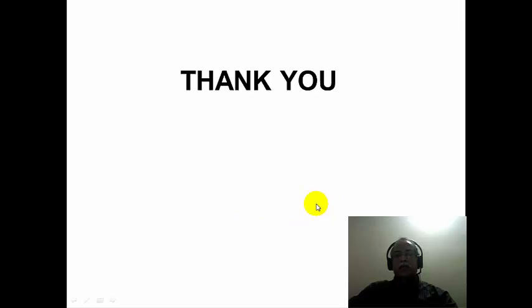Now, what we have seen in this module is a tutorial session trying to solve some problems based on the mass spectrum. The most important thing is that we have demonstrated how isotope substitution reactions can be conveniently studied by mass spectrometry. We have 3 examples of isotope substitution. The first two examples are deuterium substitution on toluene and benzene, and the third example is oxygen 18 substitution in an esterification reaction. Thank you very much for your attention.